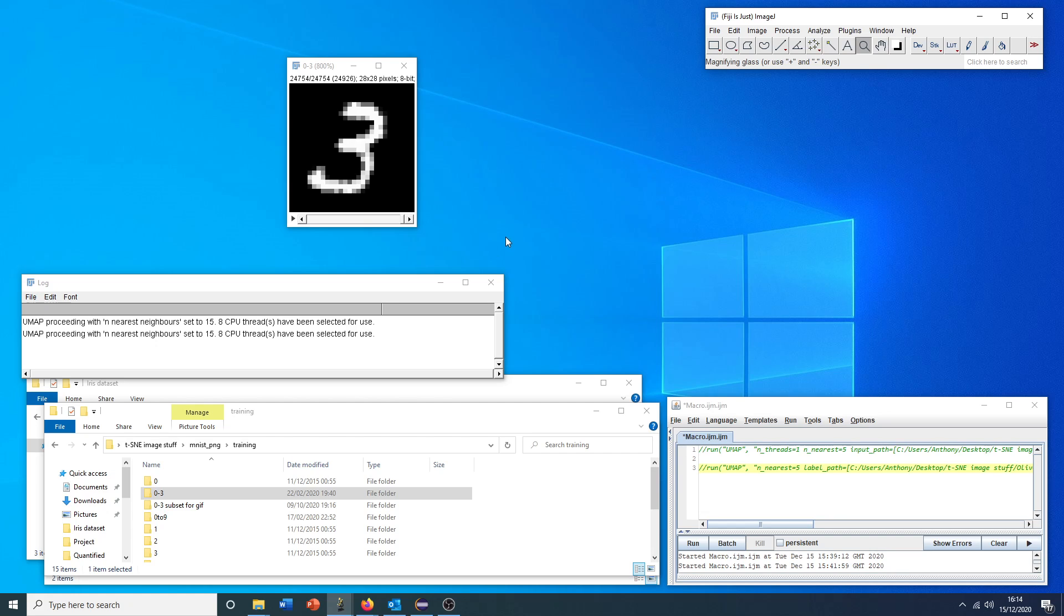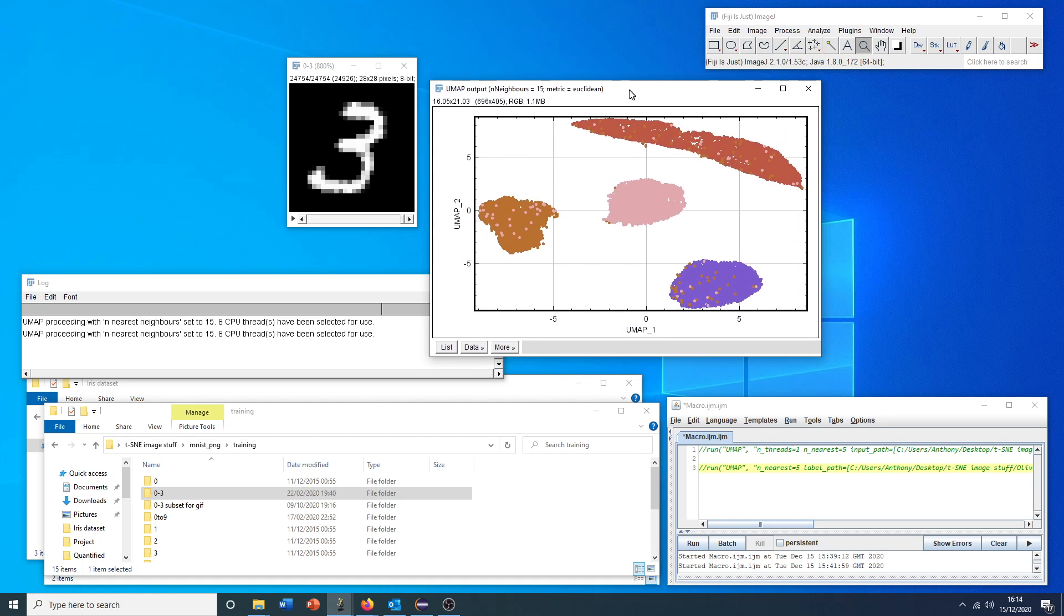Now we're asked again if we want to run it on the stack that's open. We'll say yes. This should take a similar amount of time as before. What we should expect to see now is the lower dimensional projection with our individual points colored according to the ground truth state.